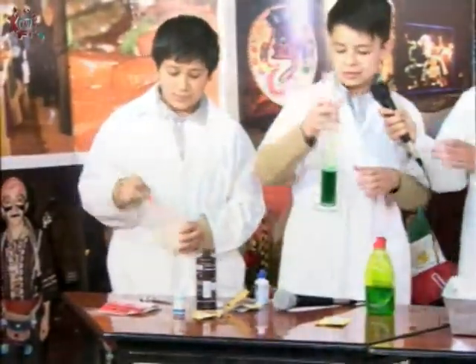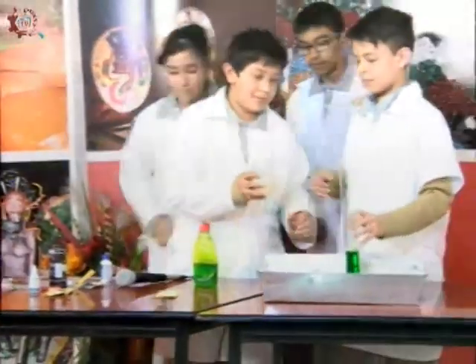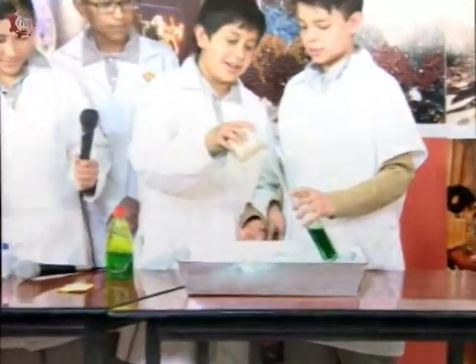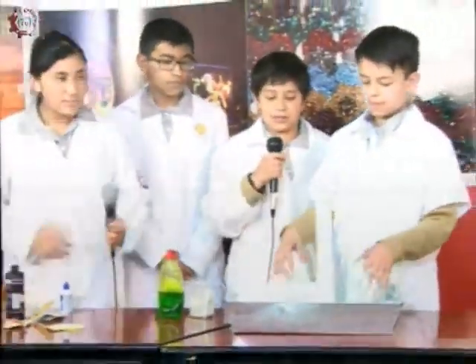Listo. Cuando lo mezclamos, eso es lo que pasa. Ahorita ustedes no lo pueden sentir, pero está caliente, la espuma está caliente. Y pues, es básicamente la reacción exotérmica.